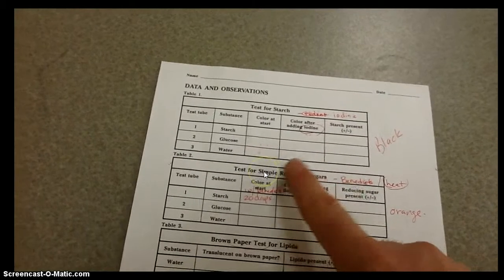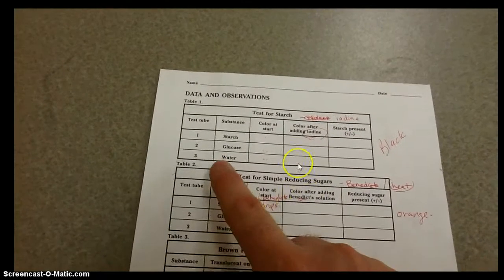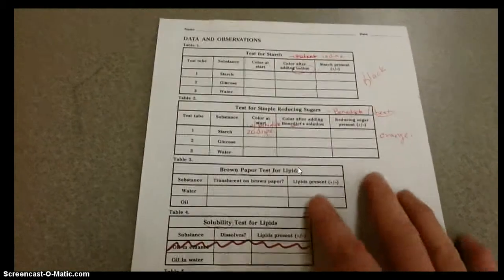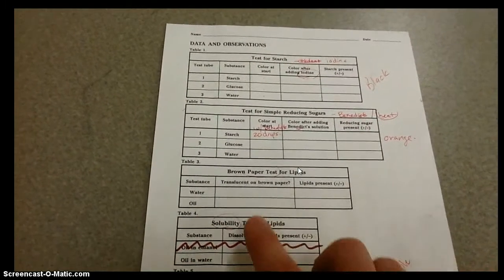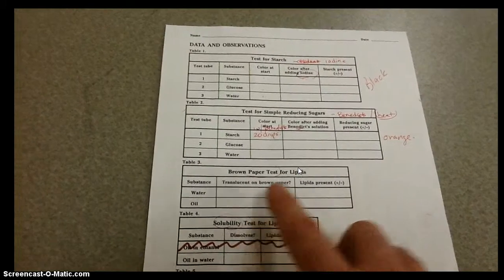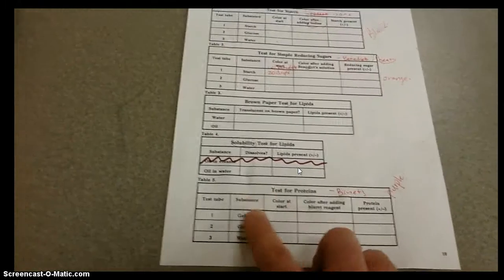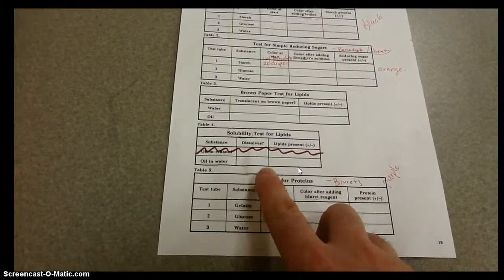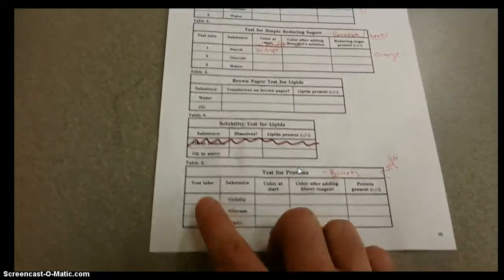Okay, move down to then the brown paper. Brown paper is the next lab. This is where you're going to be adding a droplet of water versus a droplet of oil onto the brown paper. Let it dry, hold it up to light, see if there's any lipids in it. Same thing with oil, add 1 droplet of oil to the water, what happens?